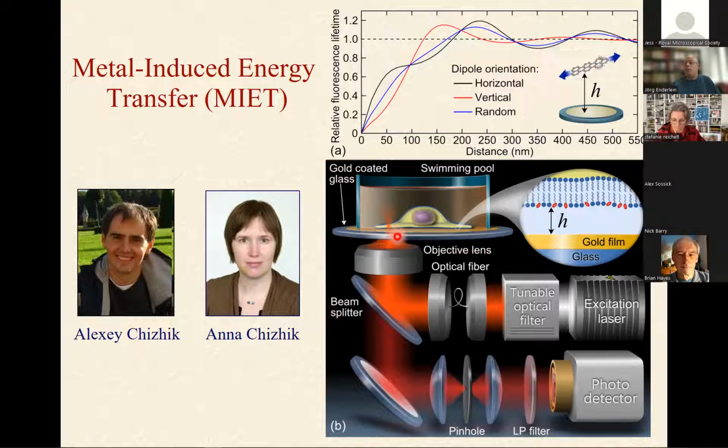And then at each scan position, we detect single photons with a very sensitive photodetector, which is also super fast in its response time, so that we can time the photon arrival times with respect to the excitation pulses. And this gives us the fluorescence lifetime information. This is called time-correlated single photon counting. I will not go too much into detail here, but it's a standard method when you do fluorescence lifetime imaging microscopy.